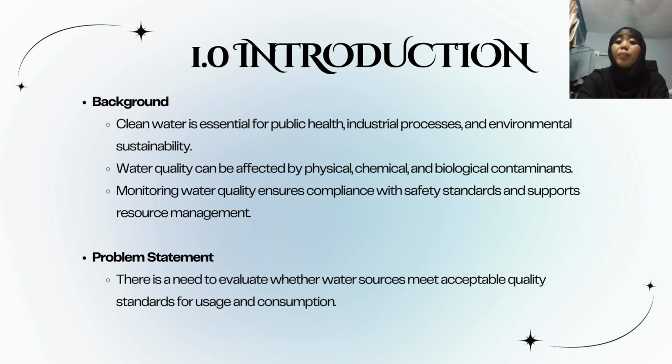Let us begin with some background. Clean and safe water is essential, not just for public health but also for industrial operation and maintaining environmental balance. However, water quality can be compromised by physical factors like sediment, chemical pollutants such as heavy metals or pH imbalances, and biological contaminants like bacteria. That's why regular monitoring of water quality is critical to ensure it meets regulatory standards and supports sustainable resource management.